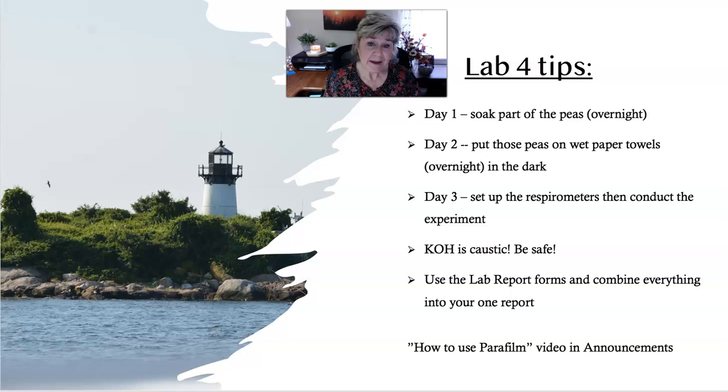I have put an extra video in the announcements on how to use parafilm because you have to do that this week. You are not familiar with parafilm. You've never used parafilm. It is one of the coolest things ever in the world. It is a stretchy type of wax paper, and it sticks to itself. So, my video is like a few seconds long, and it shows you how to grab onto the parafilm, twist it around back on itself, and it holds. So it's a very cool material to use.